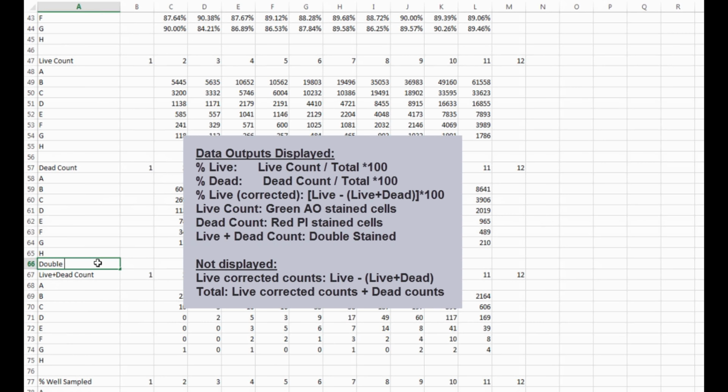And just looking at the counts, you can tell there aren't that many. But I've heard some people say, well, I've got a lot of double stained, and I quickly realized that it was probably the buffer that they put it in, which is PBS, and maybe the cells were not happy in that PBS buffer and they needed a little bit more components in there to go through this counting, as they're more sensitive cells. So that's why I switched this to HBSS with HEPES.